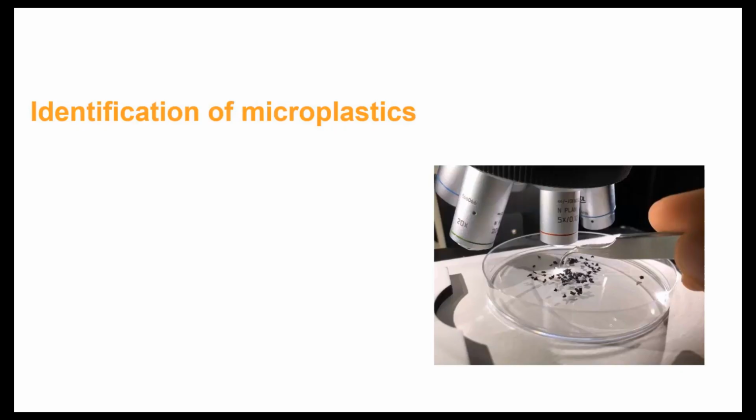In this portion of the presentation, we'll focus a little on the sample preparation required for the analysis of microplastics, and also some of the new software features which enable and speed up this analysis.